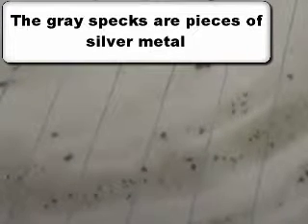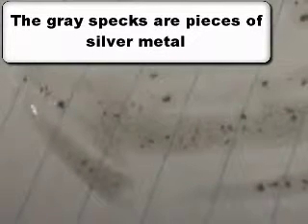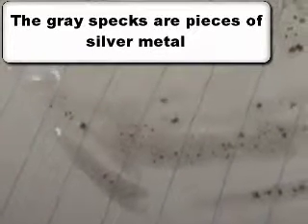So if we were to collect that silver, Mr. Sams, we could make a ring out of it. Or we could take it down to your local pawn shop and make some money. In this economy. There you go. That's why silver nitrate's so expensive, because it has actual silver in it. There you have it. Single replacement.